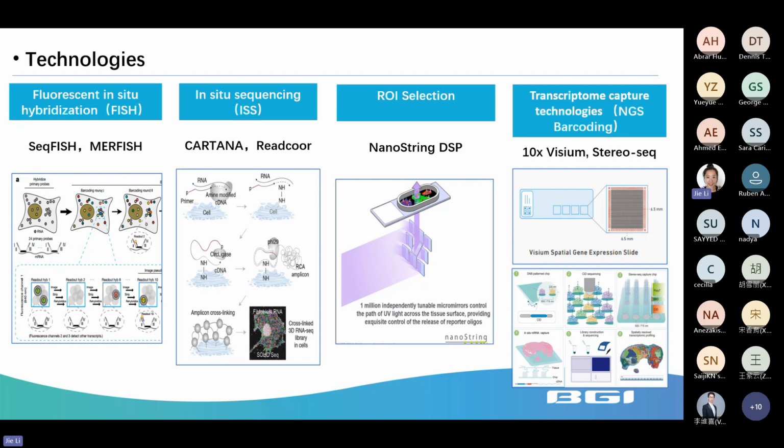So the first two can be categorized as image-based spatial transcriptome, and the last two we can say are sequencing-based spatial transcriptome.